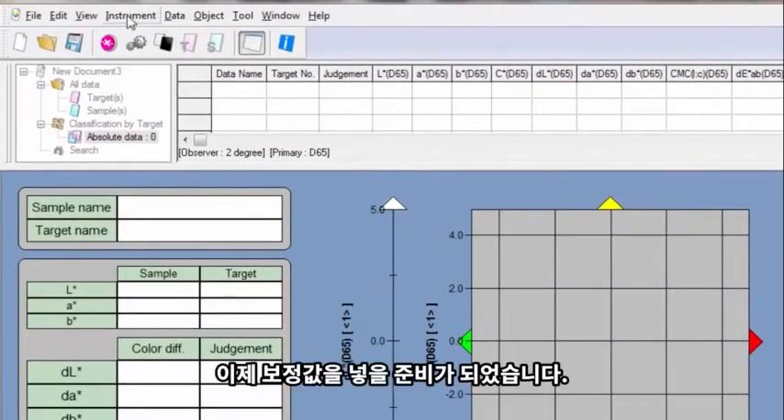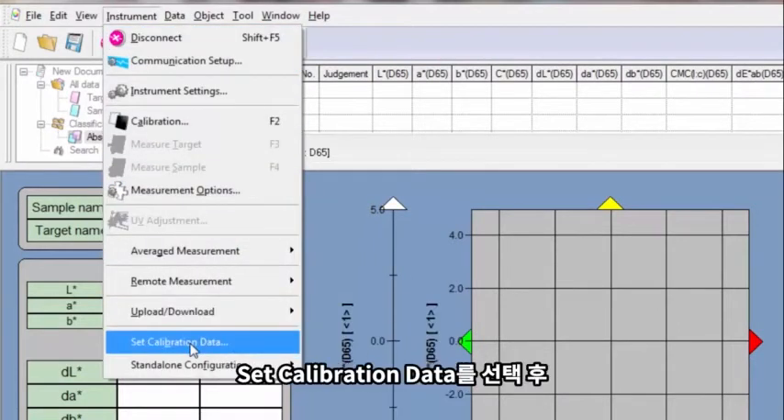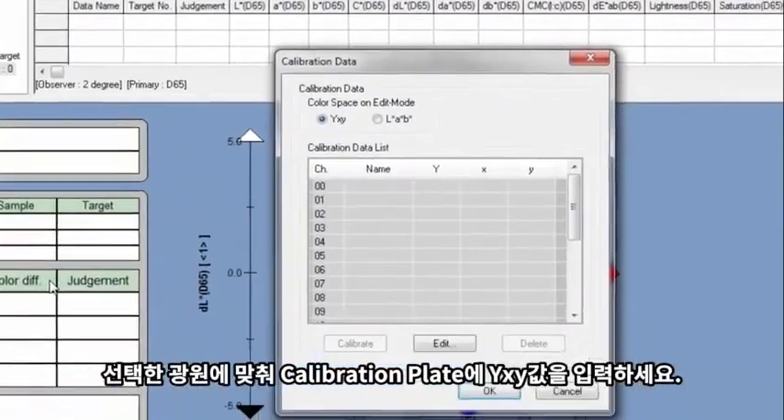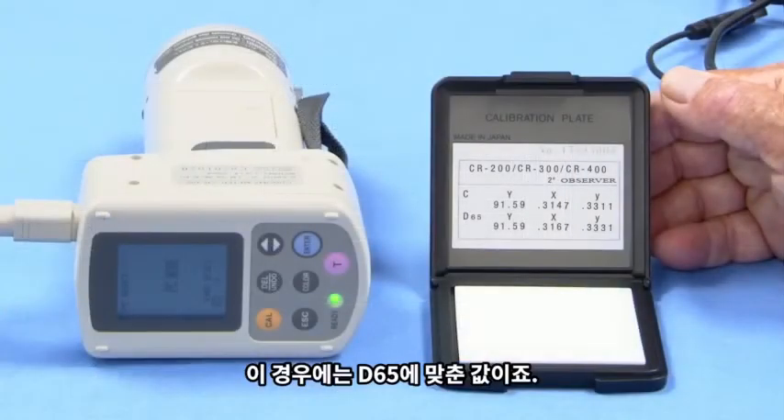We're now ready to enter calibration data. Navigate to Set Calibration Data and enter the YXY values on your white calibration plate for the corresponding illuminant — in this case, D65.